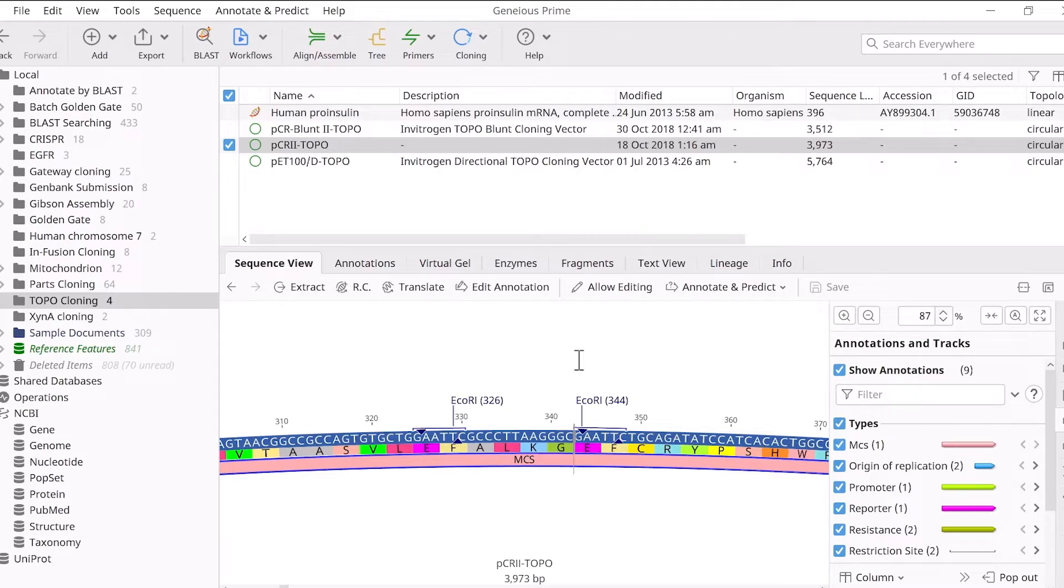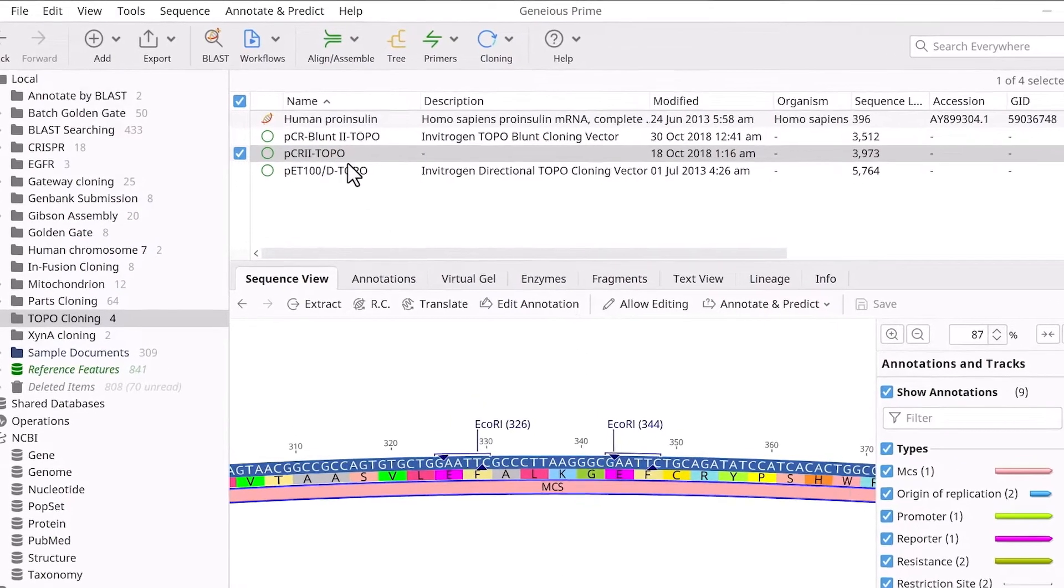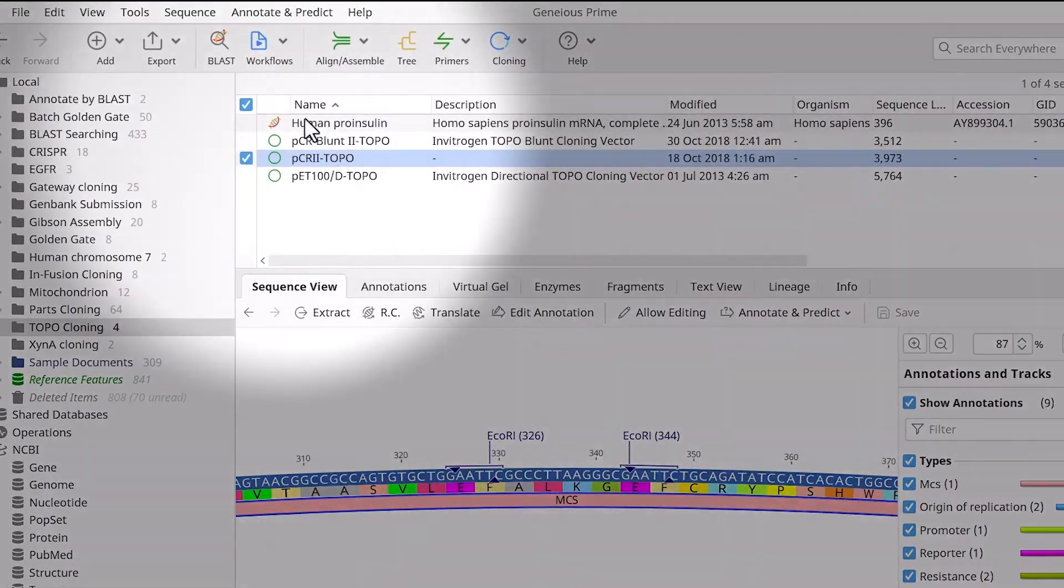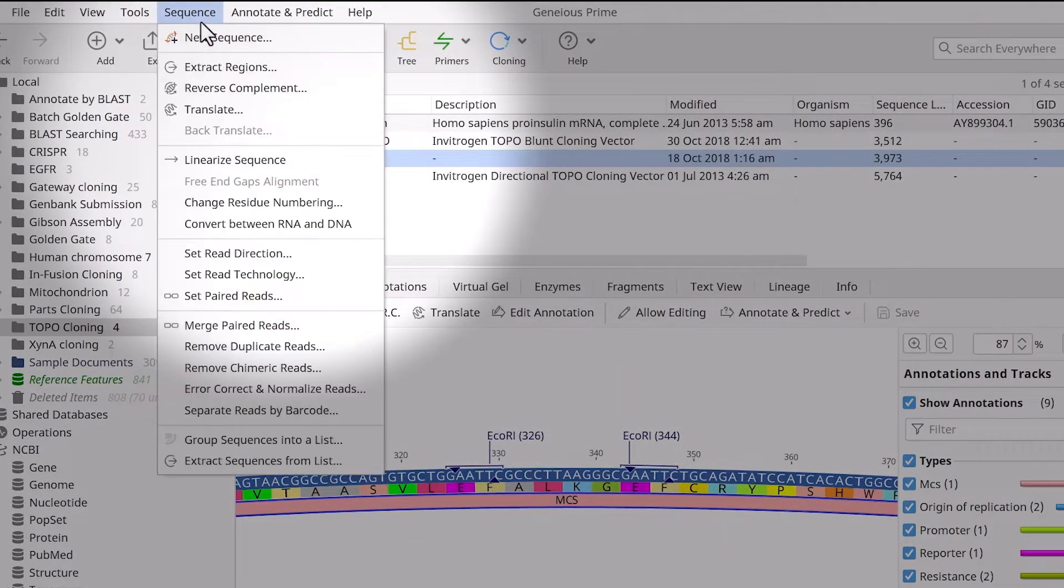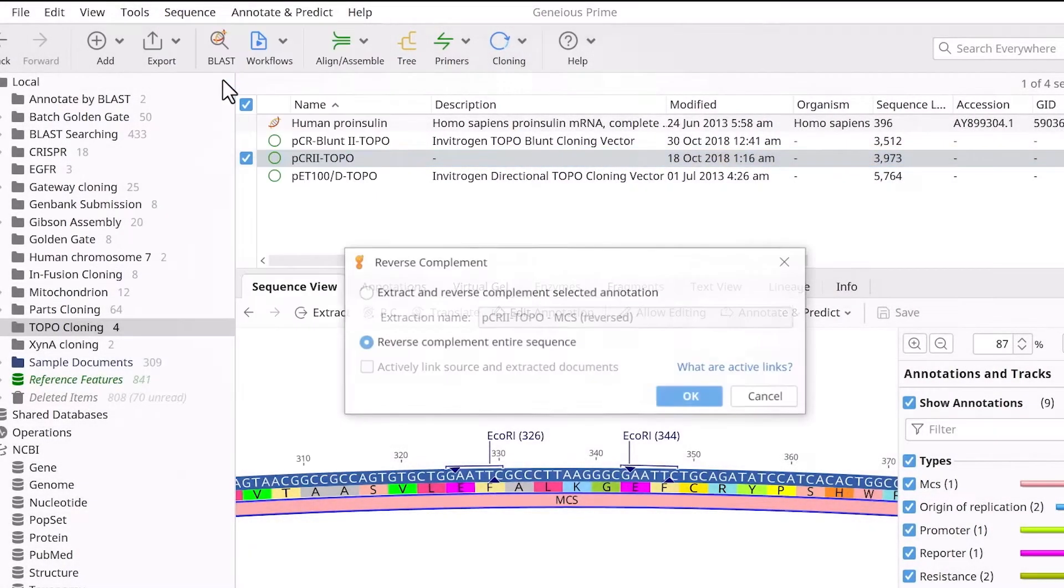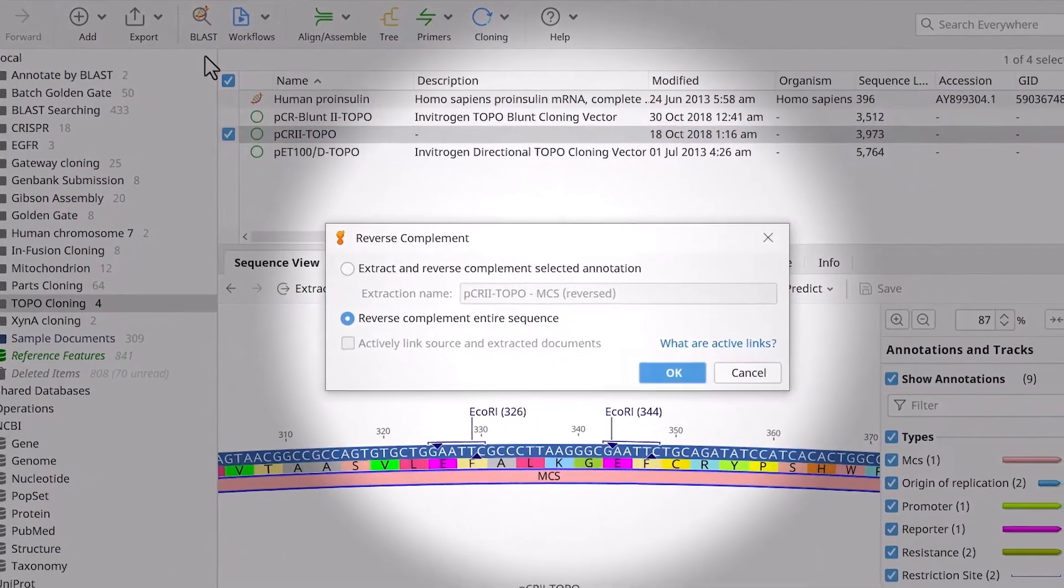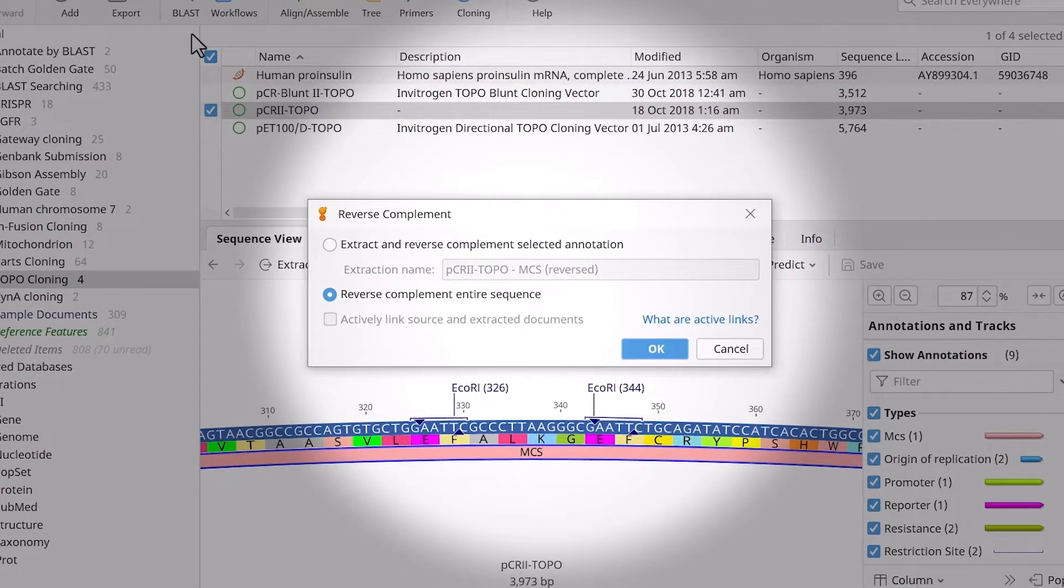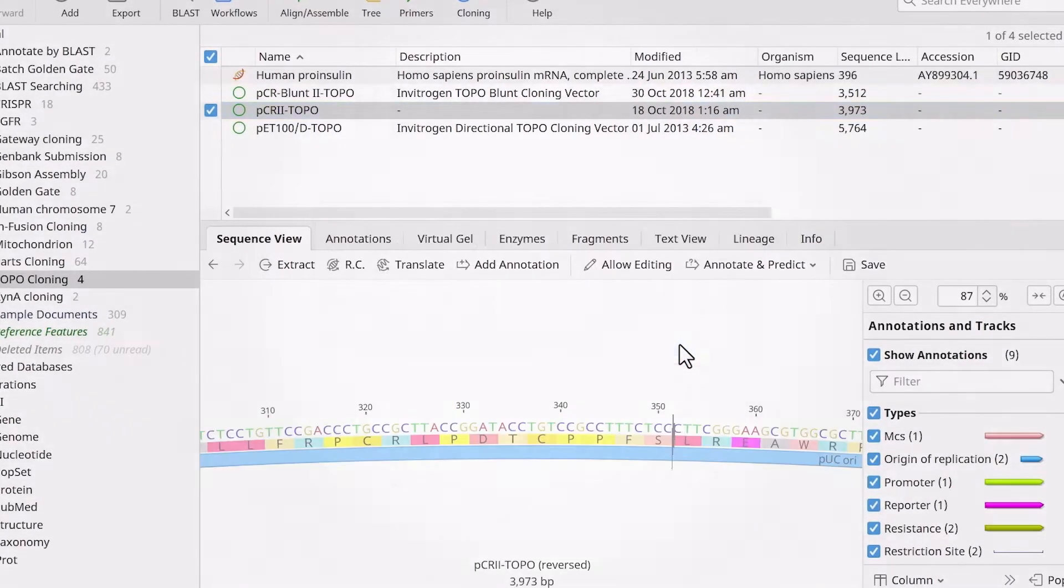To change the orientation of either sequence, select it, go to the Sequence menu, and choose Reverse Complement. In the new window, choose to reverse complement the entire sequence and click OK.